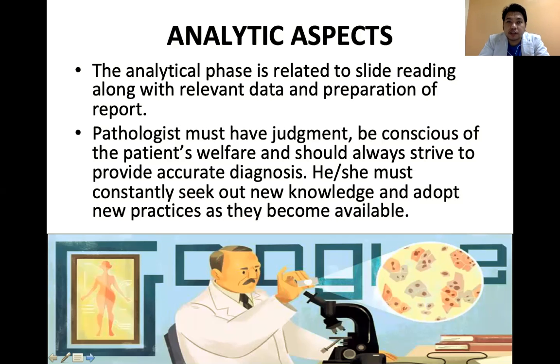Okay, it's being checked again by the chief medical technologist, and it's being checked finally by the pathologist before they're going to sign the results. So merong 4 signatories yun. Pero sa iba naman, 3. Ikaw, chief medtech, and the pathologist. So there's no way na magkakamali ka because tatlo yung check, unless you bypass those procedures or the SOP and release the result yourself. Mangyari nun, possible na hindi accurate yung results mo or hindi tama.